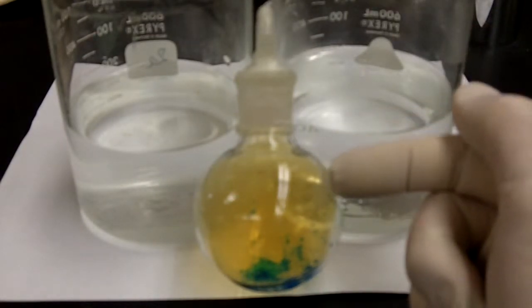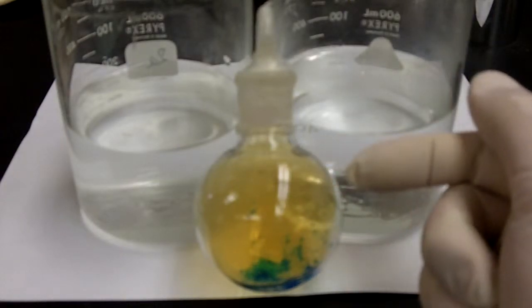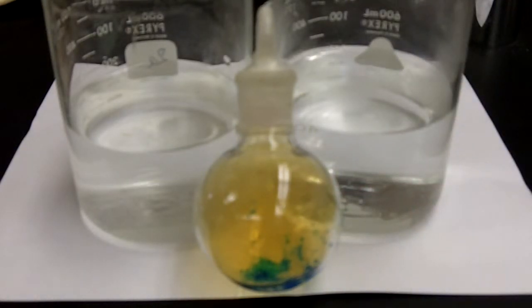Here in this round flask, we have this mixture between NO2 and N2O4. The NO2 is what gives it its distinctive brown coloration. But it's not completely brown because you have the majority of the substance in there in the N2O4 form.